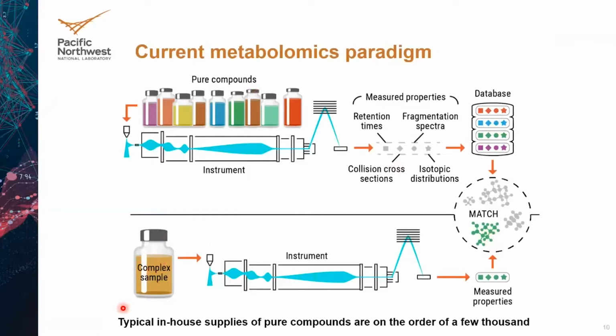And so we, as metabolomics scientists, pretty much identify the same molecules over and over again, because those are the same molecules that we can buy from chemical suppliers. If you look through the literature at some of these analyses of what we call chemical space, the expanse of chemicals that are thermodynamically stable that might appear in nature, some estimates put that at anywhere from 10 to the 30 to 10 to the 60 compounds, and a lot of those are based on combinatorial approaches. But the point being, there's a lot of chemistry out in the world that we currently have an inability to confidently identify in our high throughput screening studies.